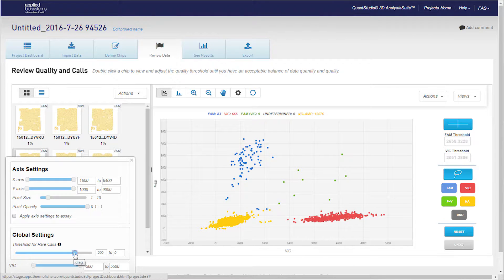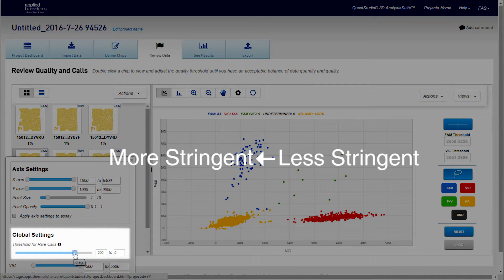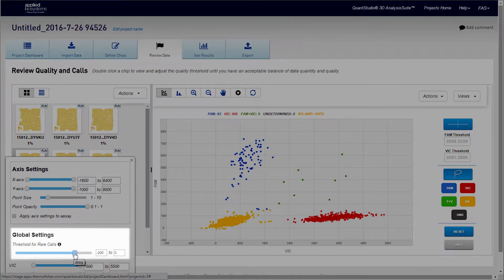Review your chips and assign a value that provides the best objective automatic calling of all your chips. Due to the nature of the function, you can think of the slider bar as going from more stringent — you'll get less rare positive points — to less stringent, where you'll get more rare positive points.